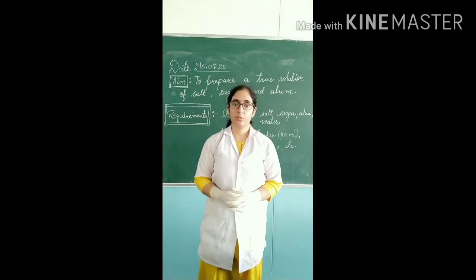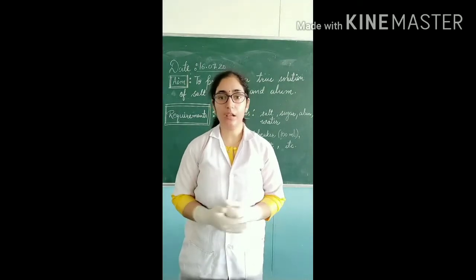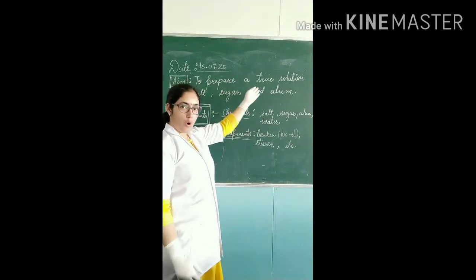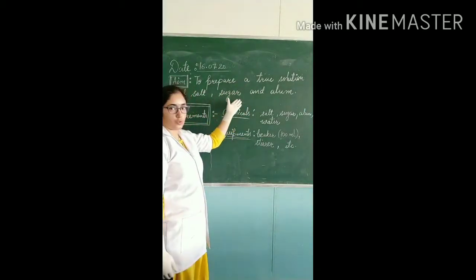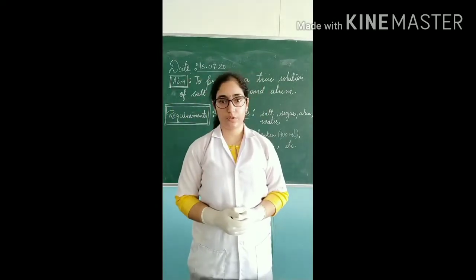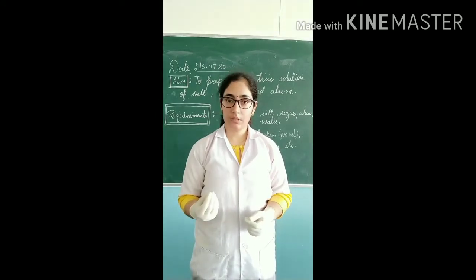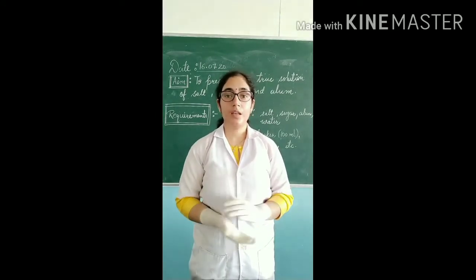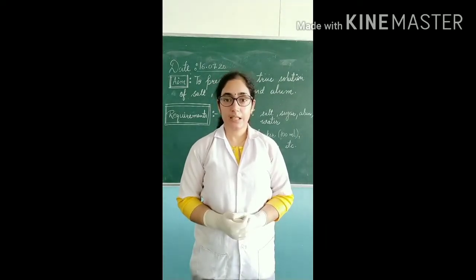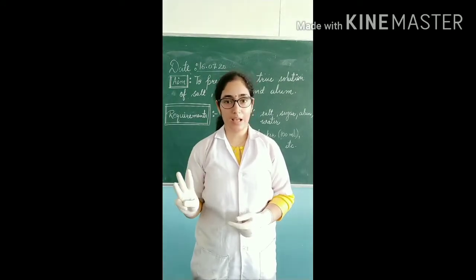Hello students, today we are going to perform an activity, a practical for 9th class, to prepare true solutions of salt, sugar and alum. We have already studied what true solutions are. True solutions are solutions in which solute and solvent are both miscible with each other. So we are going to take three solutes: salt, sugar and alum.